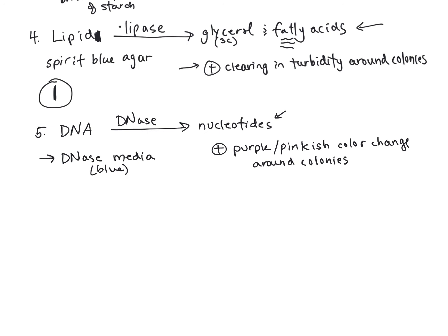Okay, so again, your book does a really good job of covering that. I just wanted to clarify those reactions. You should know the substrates and the products, as well as the enzymes that we're testing for, the media that we put it on, and how to read the results.